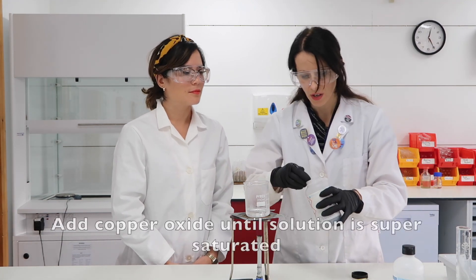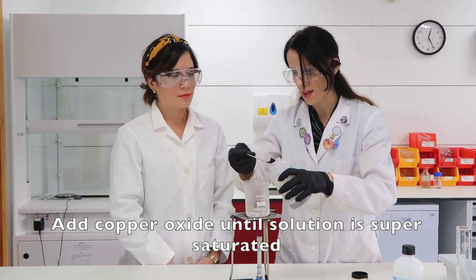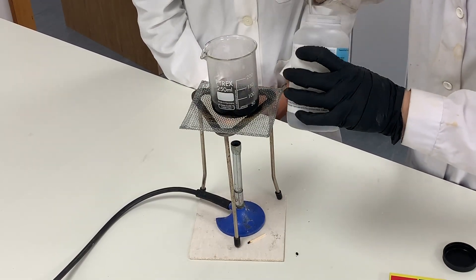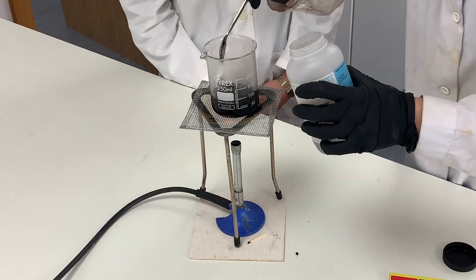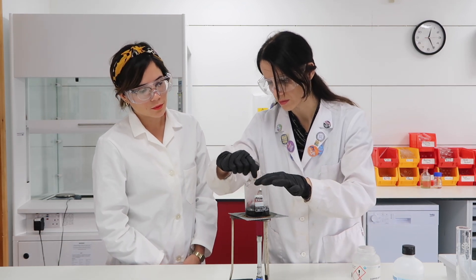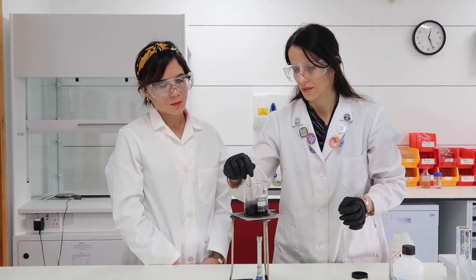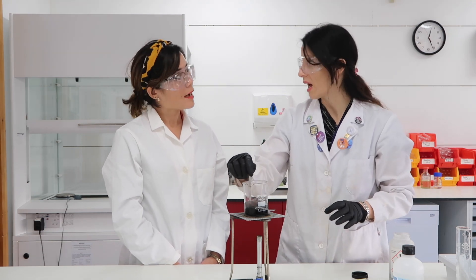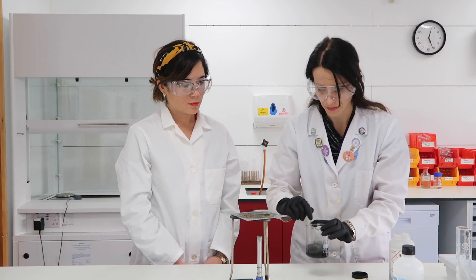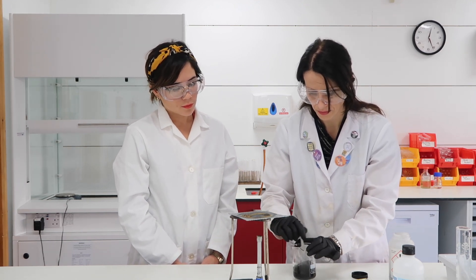I'm going to add copper oxide until it doesn't dissolve anymore — so we're going to make a supersaturated solution. Yes, that's essential. We need a saturated solution in order to produce a salt. That is warm enough — we don't want it to boil. So we have our saturated solution.